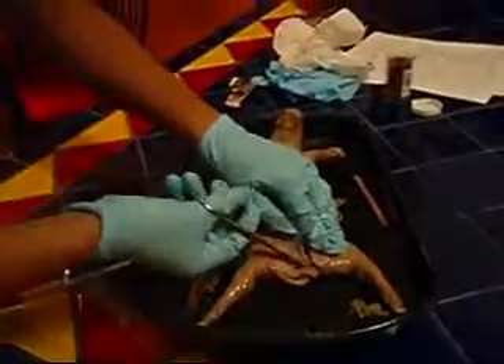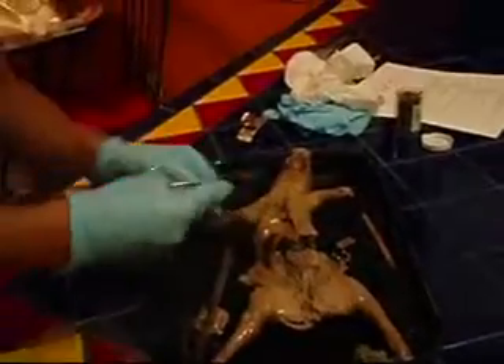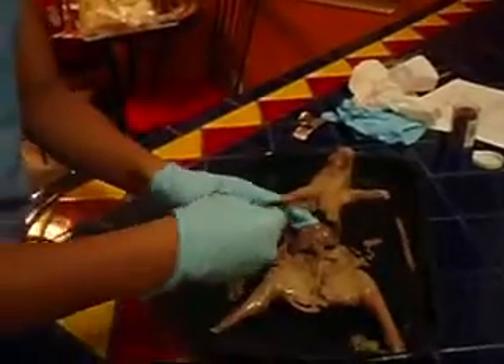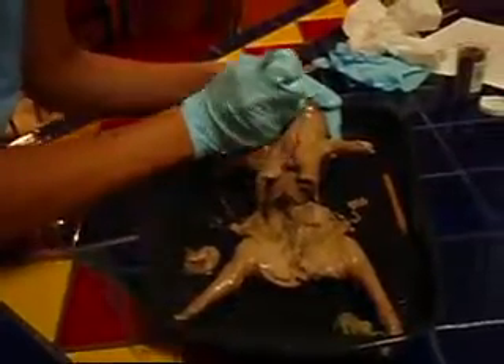Lastly, we'll need to cut through the pig's sternum to expose the chest cavity, which is also called the thoracic cavity. Look at the diagram to make your incisions. You'll need to cut all the way up into the pig's neck and open the thoracic cavity. Then we'll identify each of the following organs.